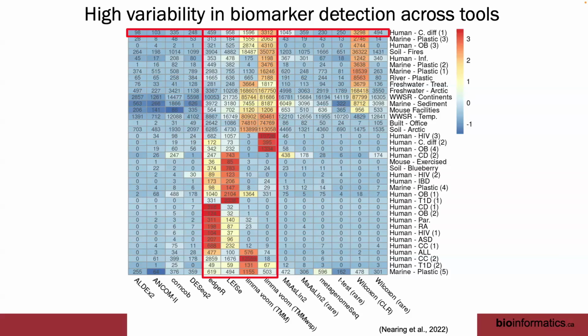Yes, question. Just to make sure, these methods are supposed to be interchangeable? Like when you're choosing your analysis, you could choose either of them? Yeah, that's a good question, actually. A statistician would say no. But in practice, within the field of microbiome, you could definitely see many of these different methods applied for the same question, right? The question being what taxa are different between my two groups. Would you see people apply t-tests? No, not usually, but we just include it for the heck of it. But many of these other tools, Maaslin, LEfSe, ANCOM, ALDEx2, corncob, you would see them across manuscripts.